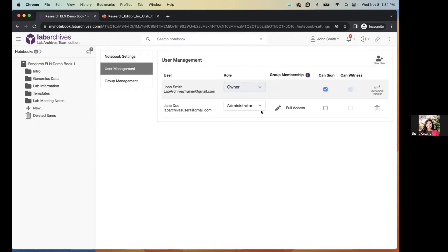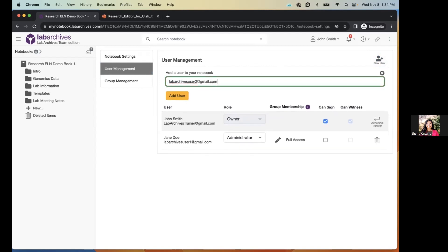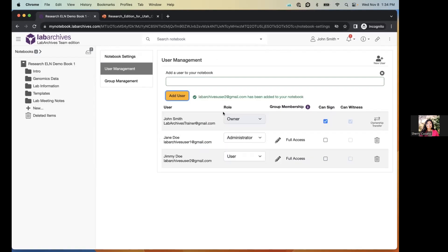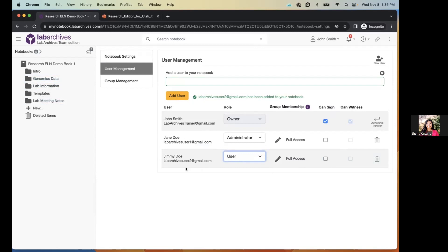To add a new user, click 'Plus New User' and type in the individual's email. For example, adding 'Jimmy Doe' as a user gives them read and write access to the entire notebook by default but no sharing ability. You can change their role — promoting them to administrator or demoting them to guest. If someone leaves your lab, click the trash icon to remove them. Their recorded data and timestamps remain in the notebook; they simply lose access.